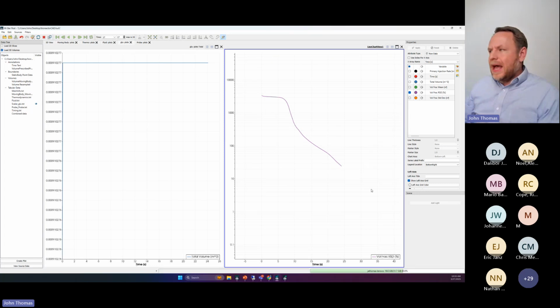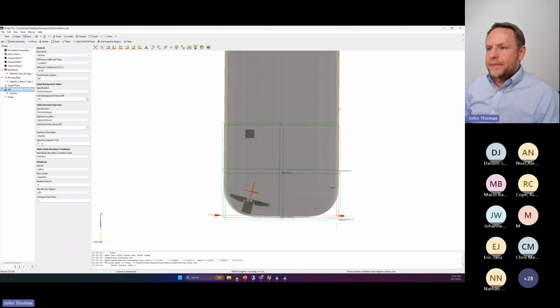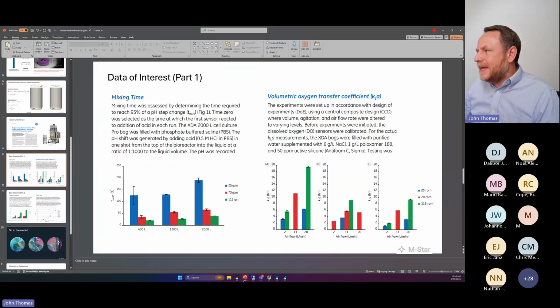And I could do that, of course. I could put the bolus in after the fluid is agitated. I could just delay the start time. I could go over to this guy and just say, add the glucose at 10 seconds or whatnot. But at the end of the day, I'm getting like a 20, 30 second blend time. Does that make sense? Is it reasonable? Yeah, it's reasonable.